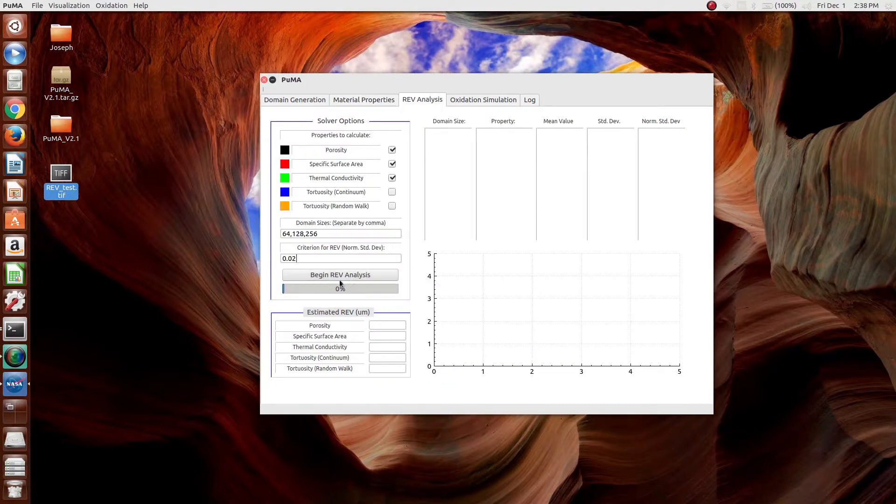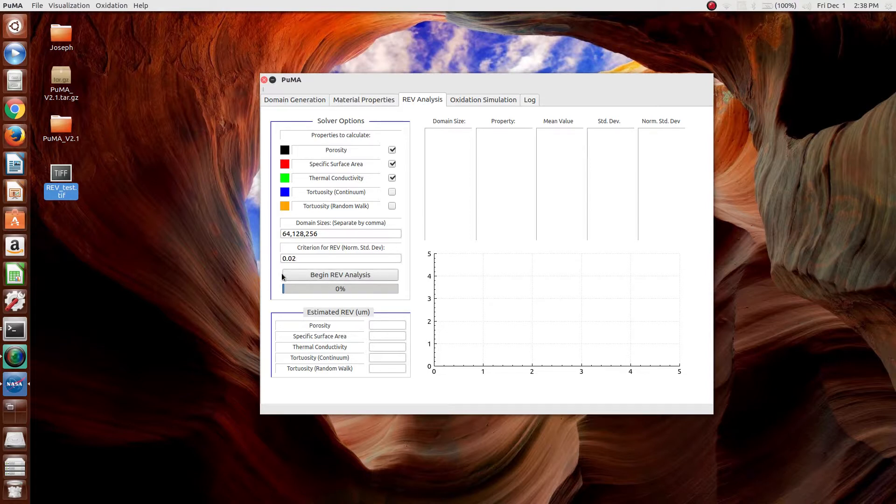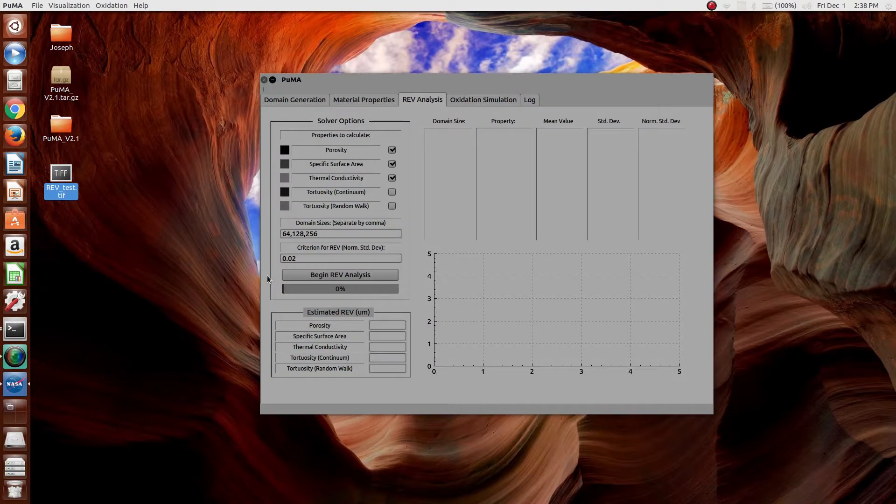At this point, the REV analysis can be done by clicking Begin REV Analysis. Now, this will probably take a few minutes, so I'm probably going to skip to the end.